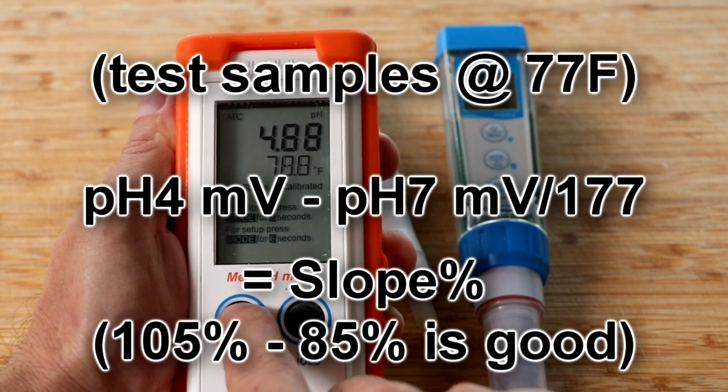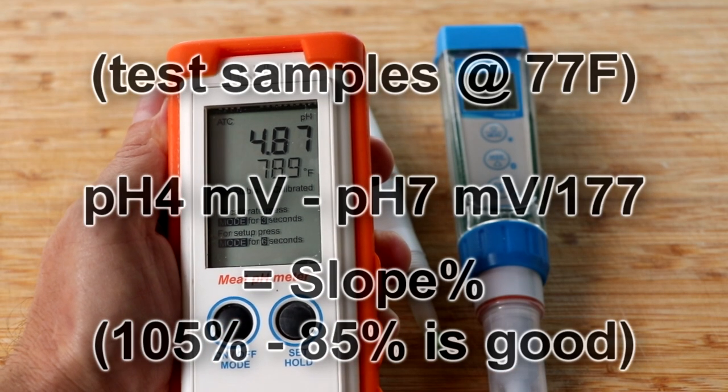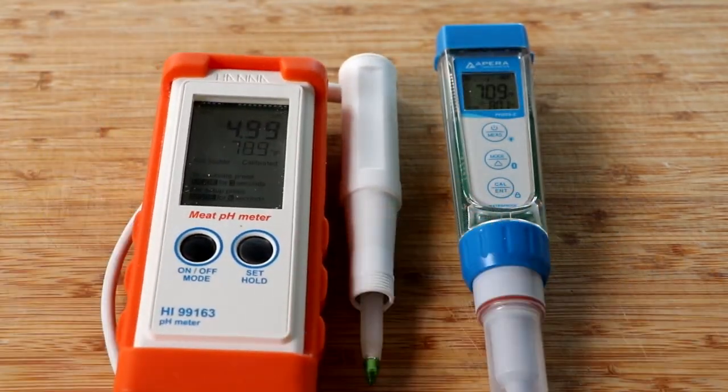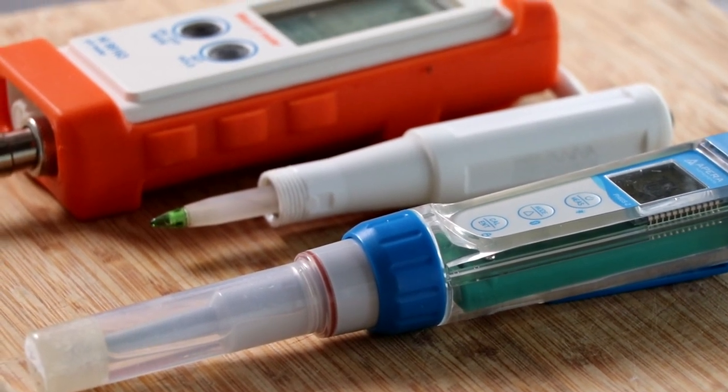What's an acceptable percentage before you'd say maybe I need to change it? They give a tolerance from about 85 to 105%, so it's pretty wide. That was Hanna Instruments explaining to us how to determine the slope of your pH meter.